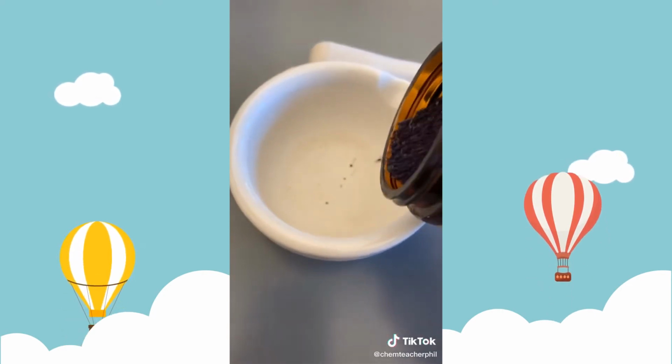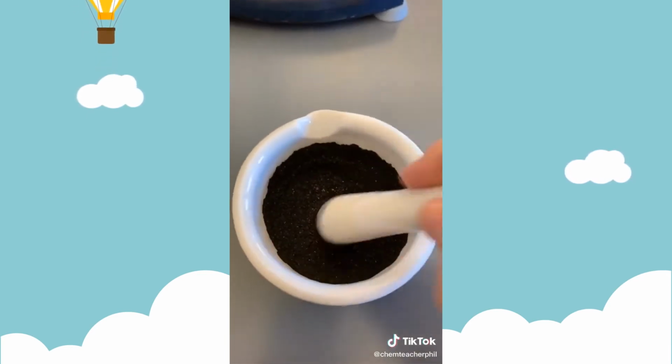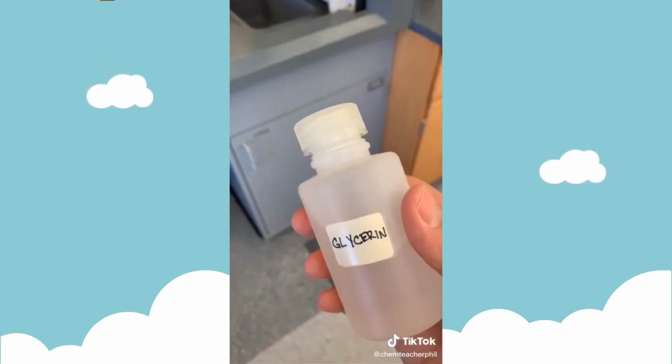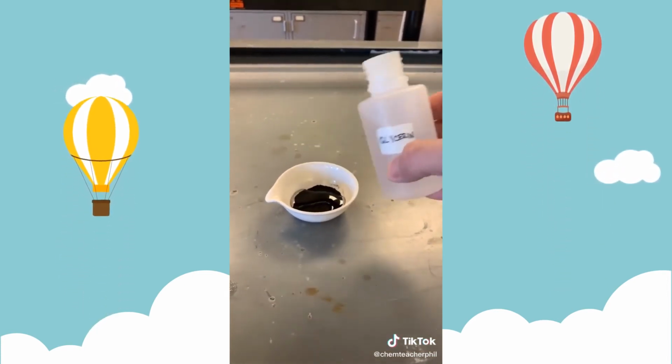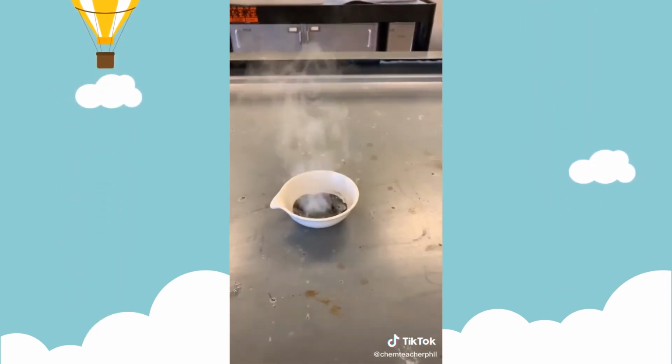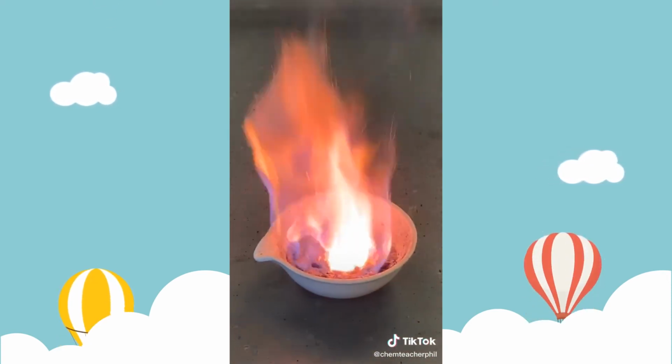So what do you do when somebody accidentally leaves a bottle of potassium permanganate and a bottle of glycerin in your lab? You put them together. A little bit of permanganate, and let's grind it up. Now we're just going to pour a little glycerin in, see what happens. That gives me an idea. Let's use that reaction to set off another reaction.